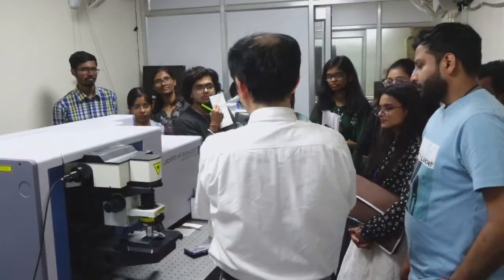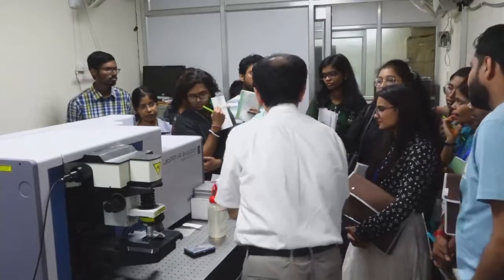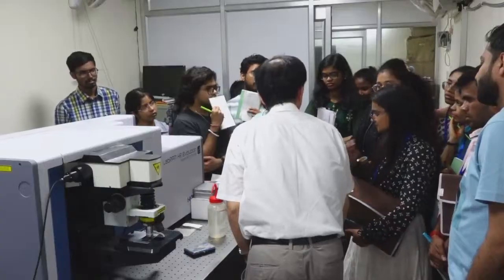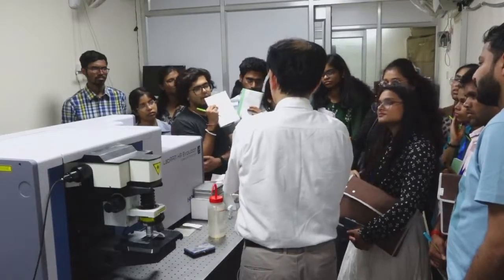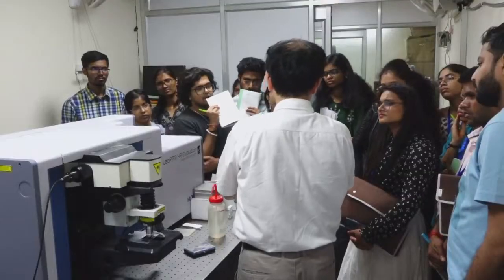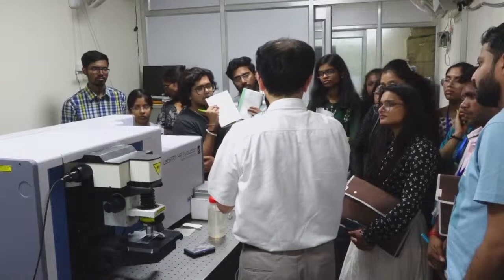Any other question? So one more question. To explain, we are using a CCD detector. Apart from this CCD, we can use other types of detector. And what is the advantage of using CCD in this particular case? So CCD is the first choice in this kind of instrument.